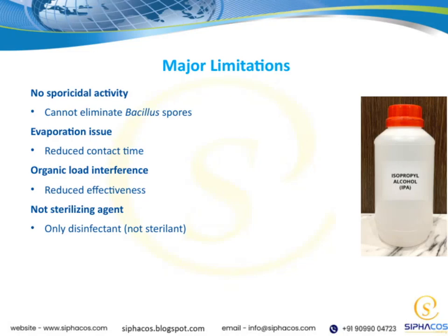Let's talk about some of the major limitations of this disinfectant. First, it has no sporicidal activity, which means it cannot eliminate bacillus spores. This is a key point because spores are often resistant and can be a real challenge in sterilization processes. Another limitation is the evaporation issue. The disinfectant tends to evaporate quickly, which reduces the contact time necessary for effective disinfection. If it evaporates too fast, it might not have enough time to do its job properly.